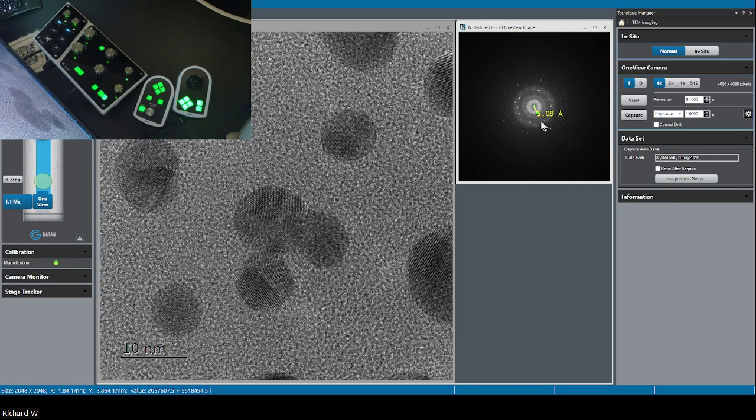Okay, so what that means is that at the higher spatial frequencies, you're going to get slightly more intensity. I hope that helps. Maybe I can talk about it after. Sorry, NTU have one more question. Give me a minute.